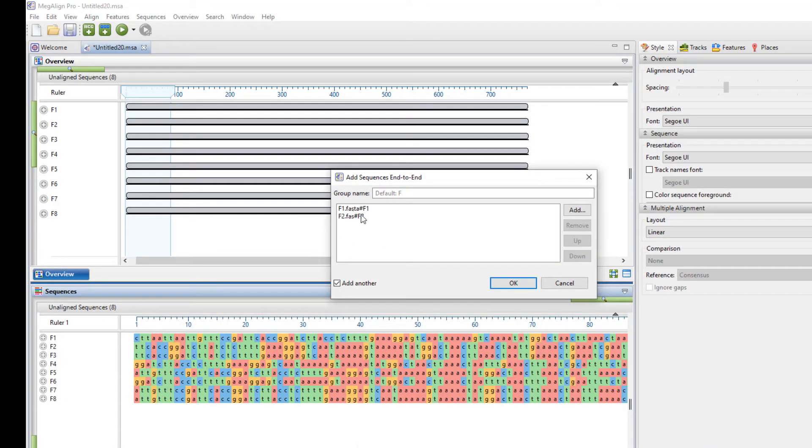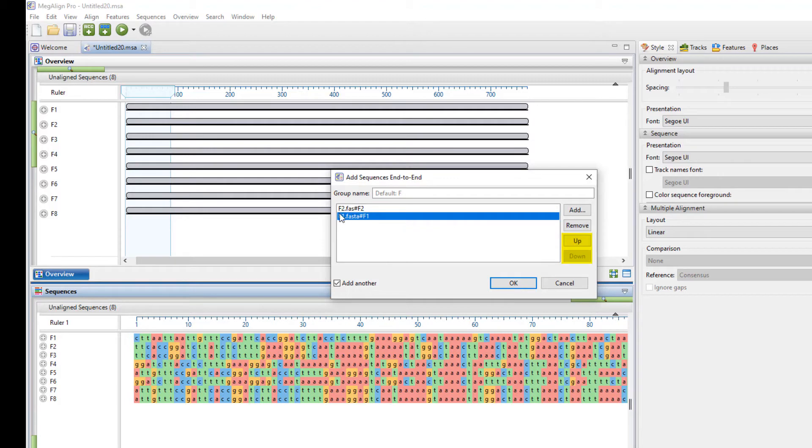So if you do not like the order that the samples are in, you can change them. Here I have my F1 and F2. I can actually rearrange those by choosing these organizational buttons on the side. Similarly, I can add and remove them as I see fit at this point.